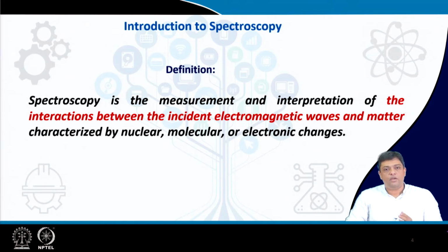Till now, we have discussed one characterization technique, X-ray diffraction, and we spent nearly 2 lectures on it. That technique was used for collecting data so that you can extract information regarding phase formation, the type of crystal lattice and various other parameters related to unit cell formation.